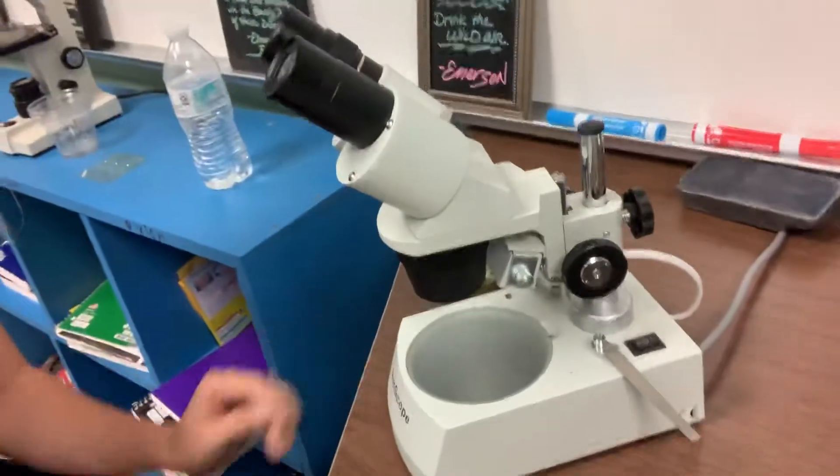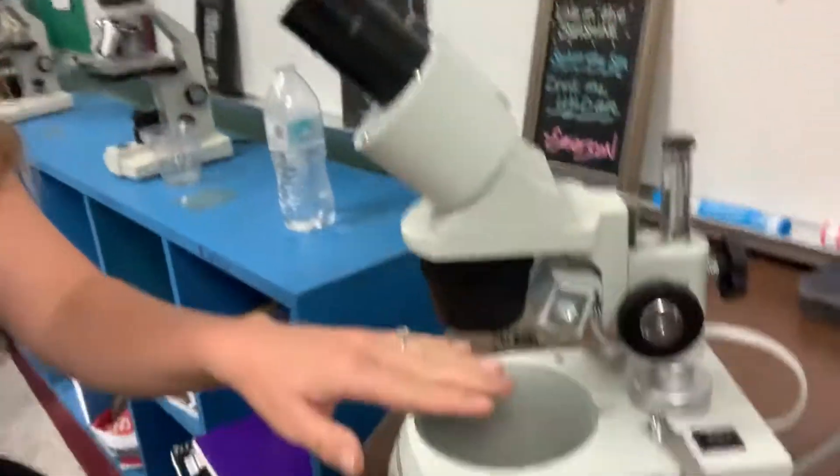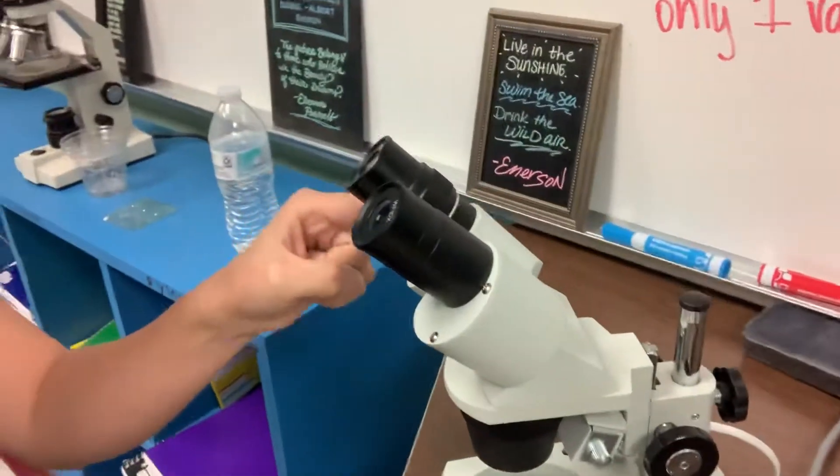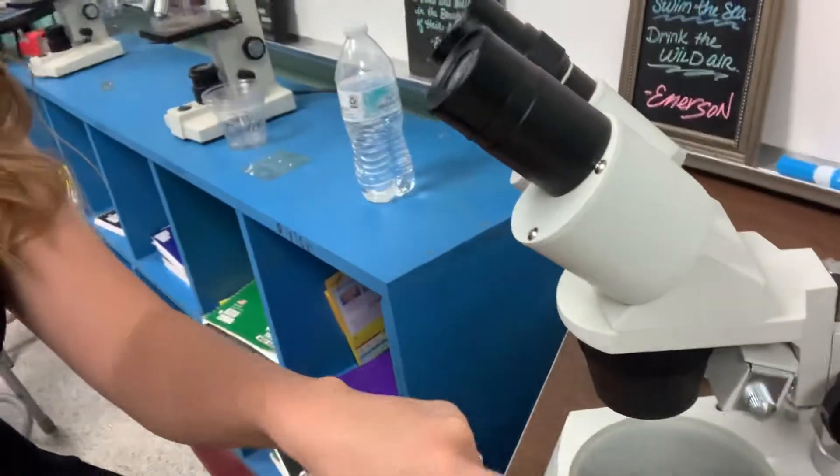This one is a dissecting scope. Notice how there's a lot more space right here. That's so that you can make a slide or look for stuff that isn't already in a slide and make it a slide. Notice how there's two ocular lenses here and there's more space right here.